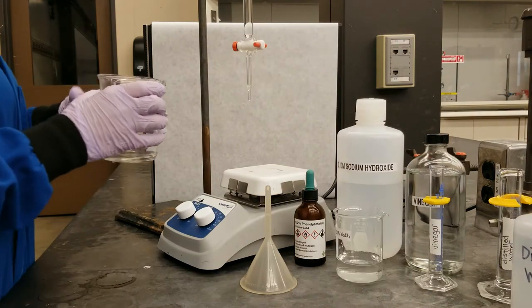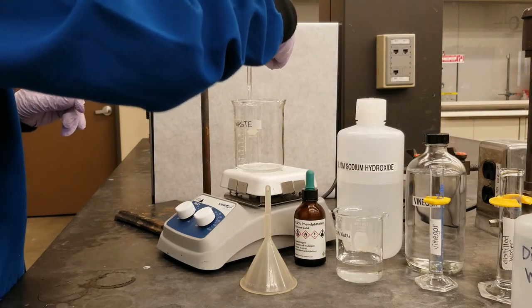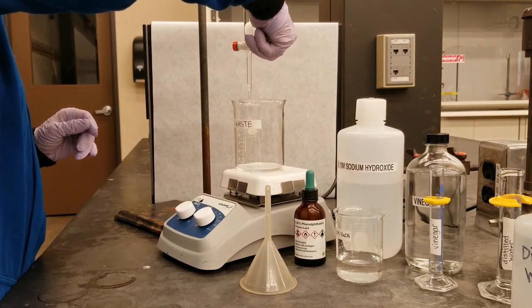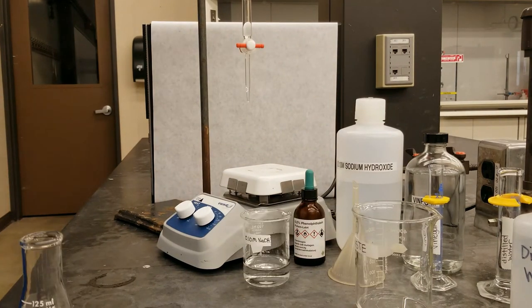So the next thing we'll do is ensure that the tip has no air bubbles and that we've primed the tip as well. So I'll open the burette and let some drain through before closing it tight and reading the initial burette reading. So now that we've primed it and released any air bubbles from the tip, we're going to do an initial reading of the burette, which is 0.5 mils.